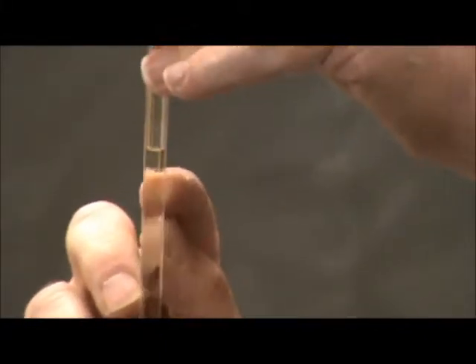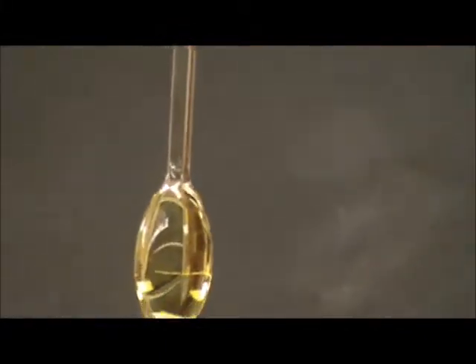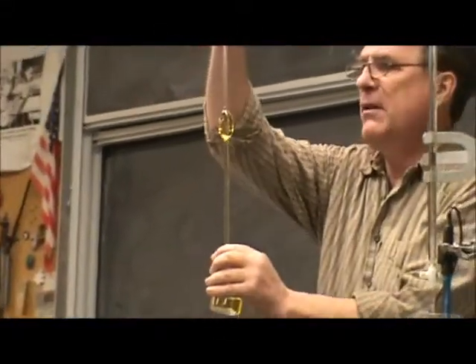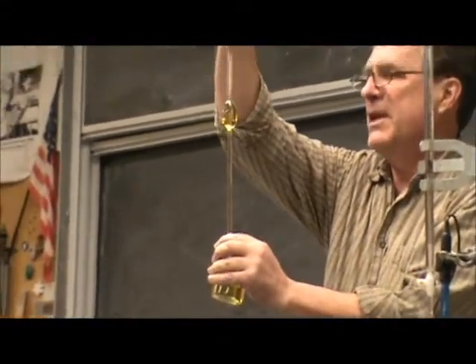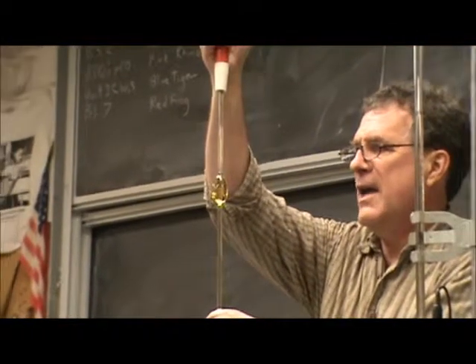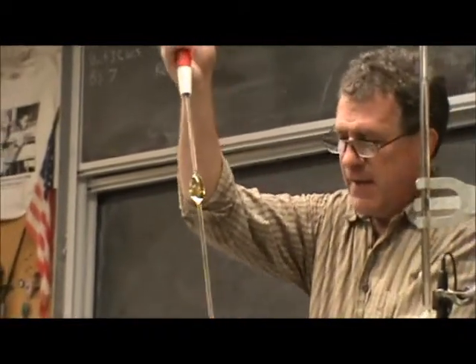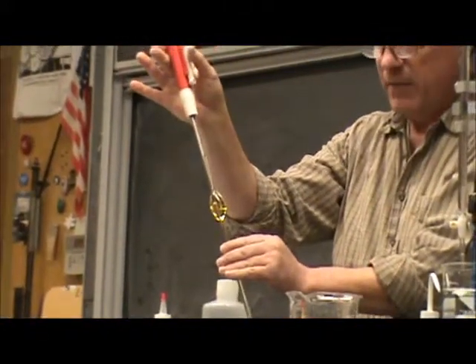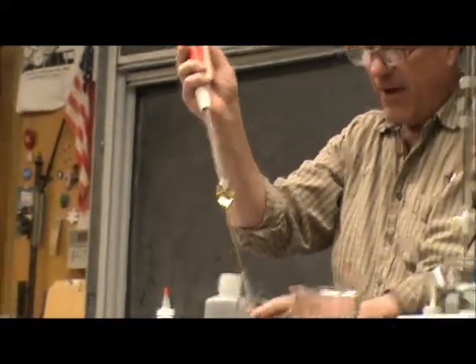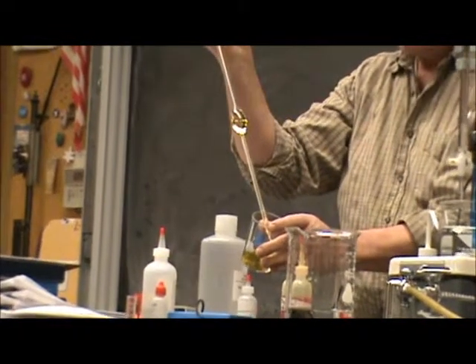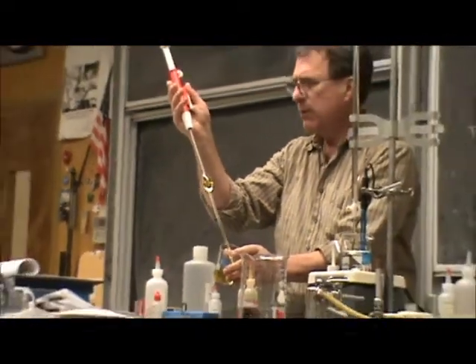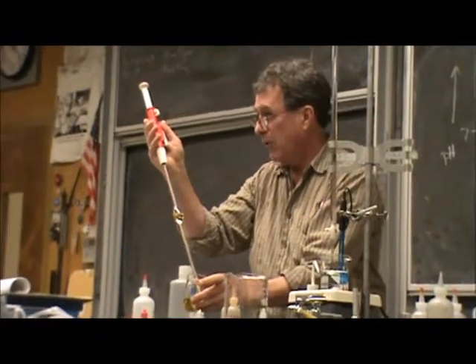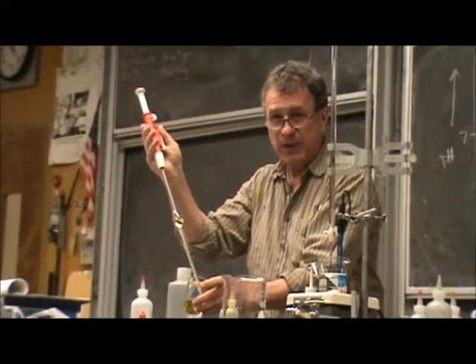If I lower the level to where the bottom of the meniscus is right at that etched line, then this pipette will deliver, when I hit the little valve right here and let the air out, it will deliver 25.00 milliliters to about an accuracy of about 0.02 milliliters.